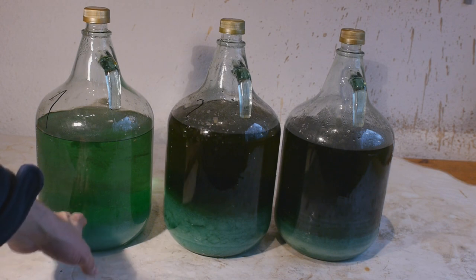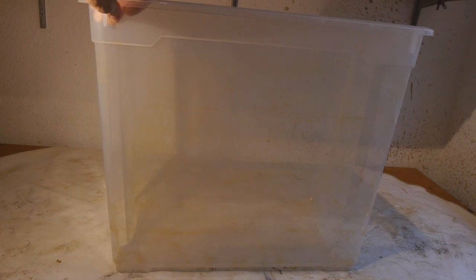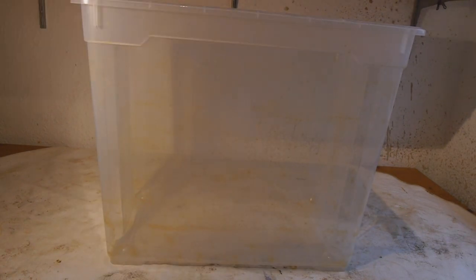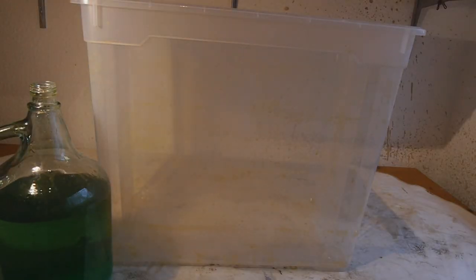Now we need a very big container where we can dissolve all these crystals in. And then we are going to use sodium hydroxide to precipitate the iron as iron hydroxide. This is the container that we're going to be using. It can hold about 50 liters or so. So let's start by pouring in everything that is already dissolved.